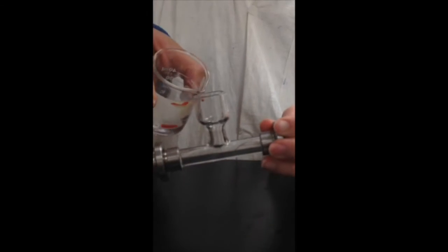Before you measure your sample's optical rotation, you have to rinse the cell twice with about 1 milliliter of your sample first to avoid diluting the sample. Now fill the cell with your sample.